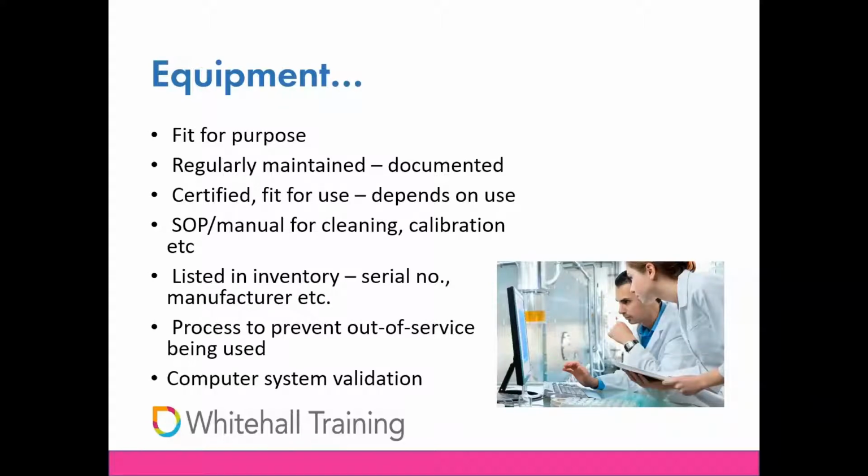It should also be possible to demonstrate that the equipment remains fit for use on an ongoing basis. So to achieve this, standard procedures need to be in place for cleaning, maintenance, calibration. You can use manufacturers' manuals as the basis for this process, or it can be done through standard operating procedures. But either way, you need to keep records of the way that these activities have been performed.